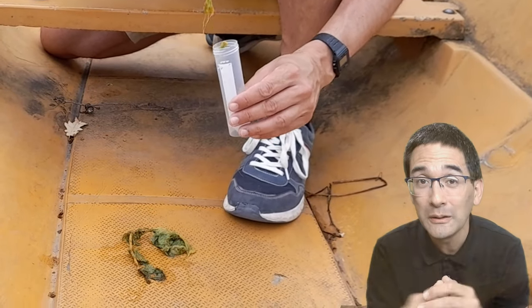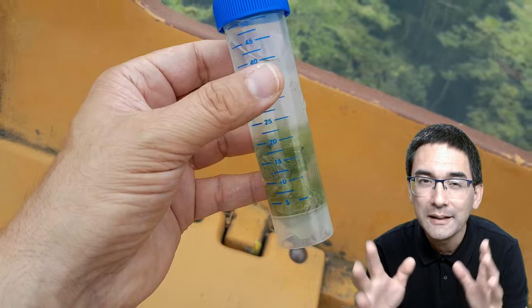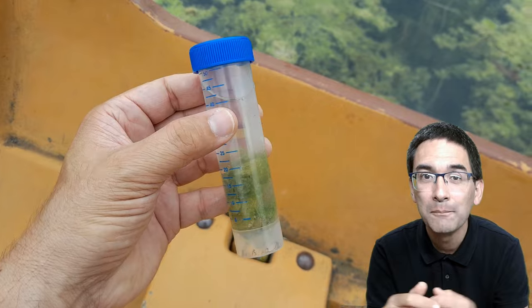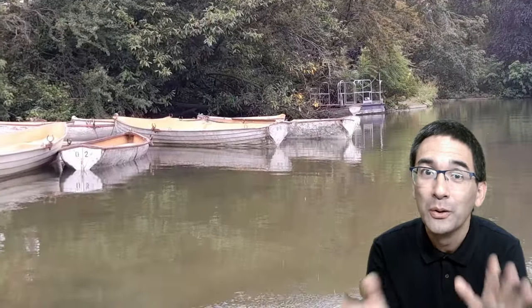I'm going to show you a little bit more of the environment where I collected those specimens, and then later I'll show you all the things I found under the microscope. I did make a mistake though and I'd like to give you the advice not to repeat it. I put a screw cap on the plastic container and this caused the specimen to decompose after a few days. I should have left it open, but unfortunately it started to decompose and some of the organisms died. Still, I can reassure you there are plenty of interesting microorganisms that I found.